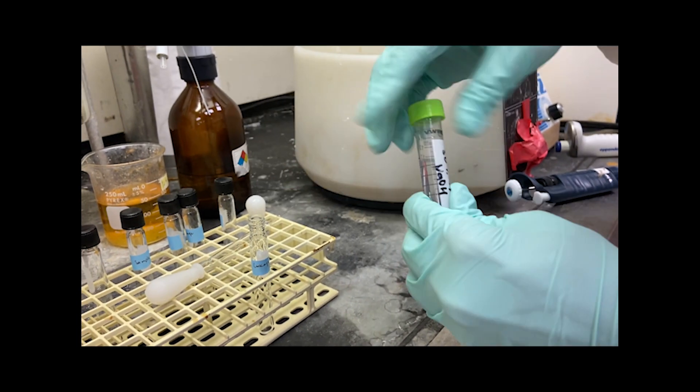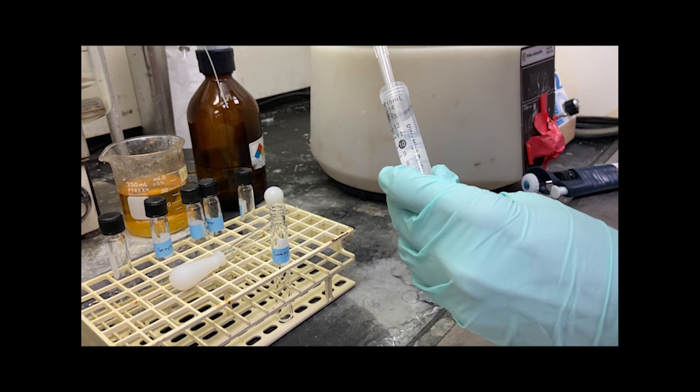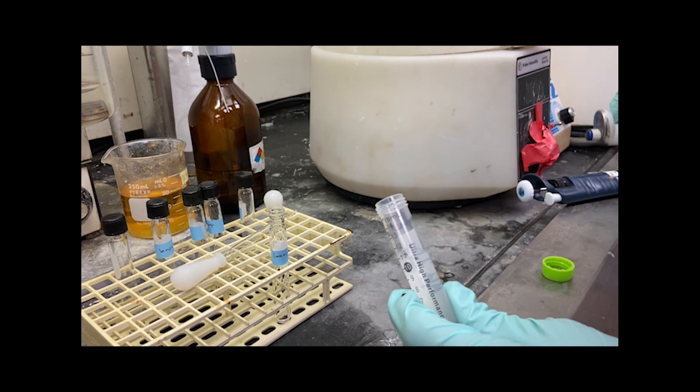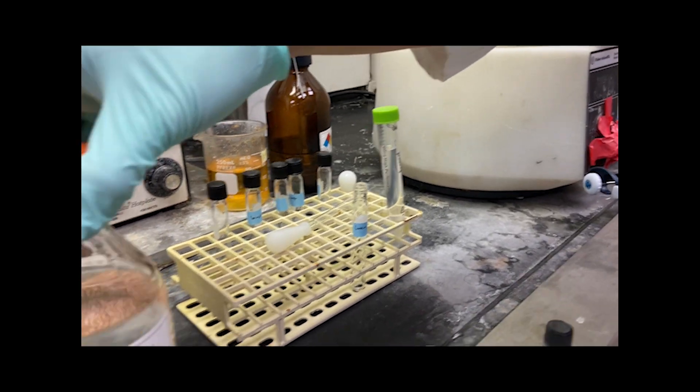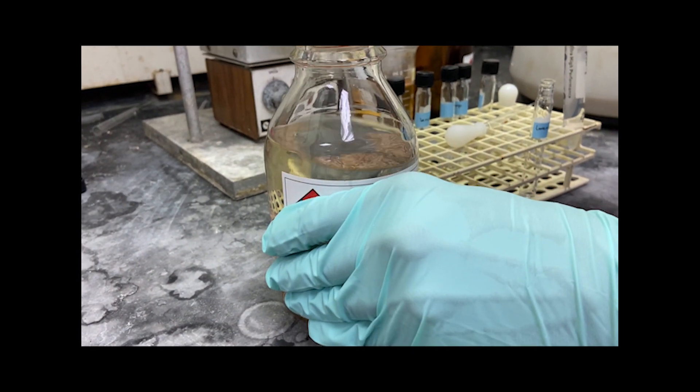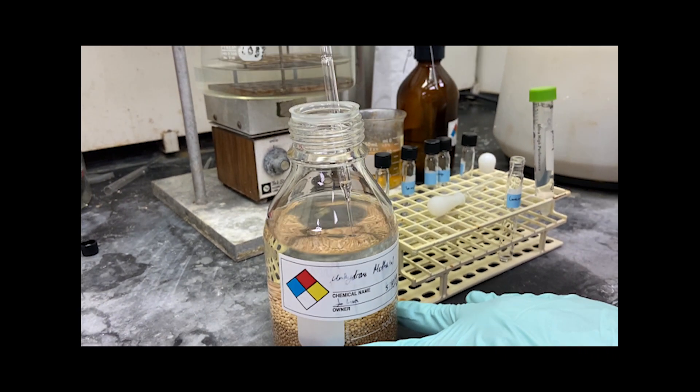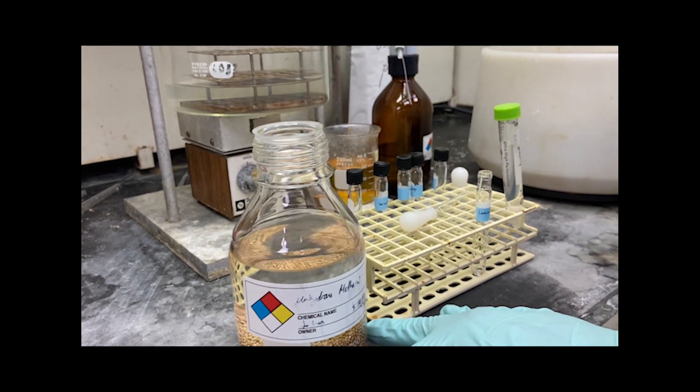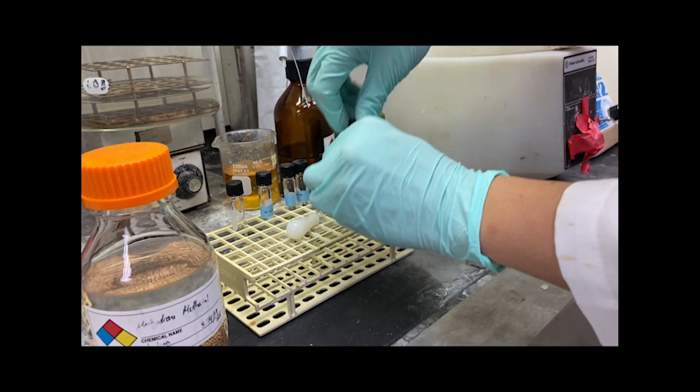For the first step of this experiment, we will start by demonstrating the preparation of the base. First, we take 100 microliters of 50% weight by weight sodium hydroxide and add 200 microliters of methanol and vortex for 3 to 5 seconds.